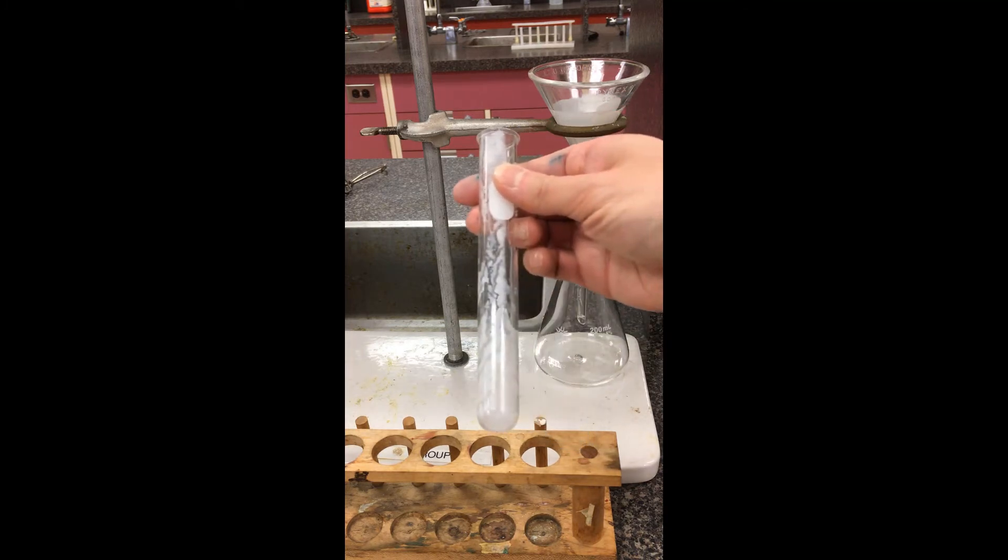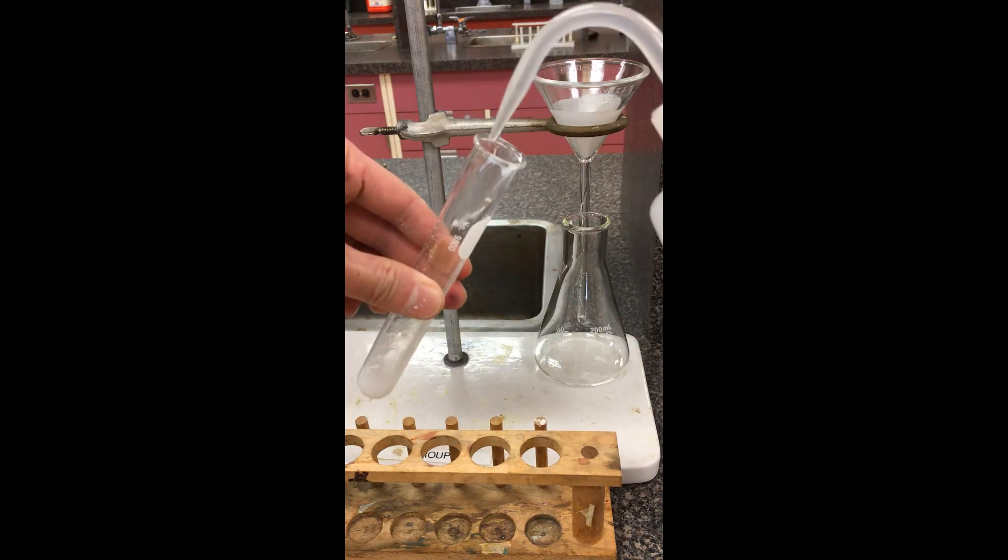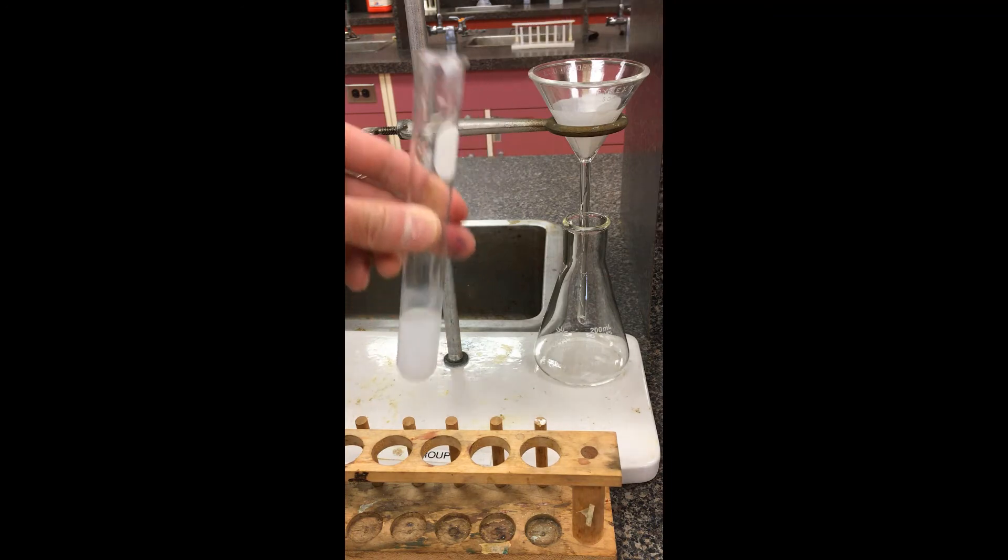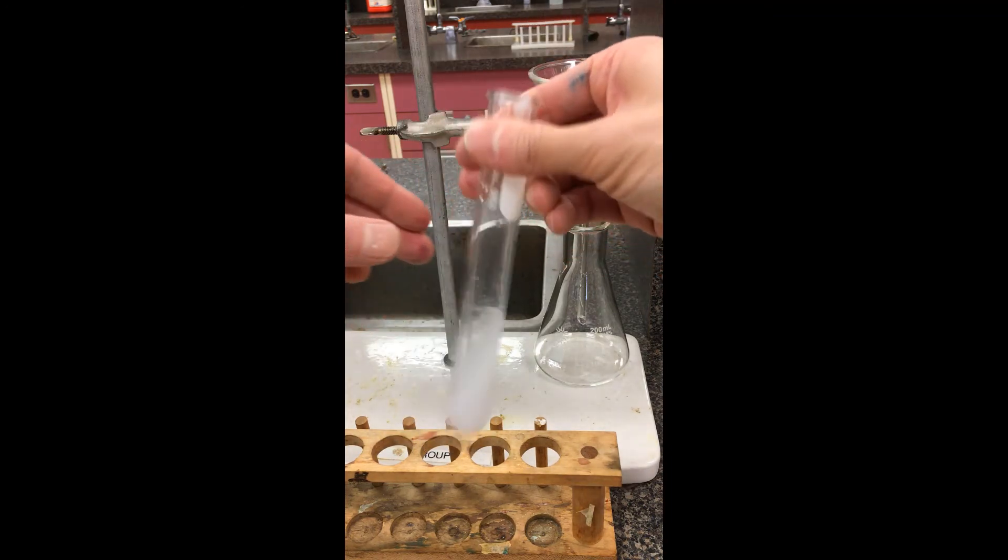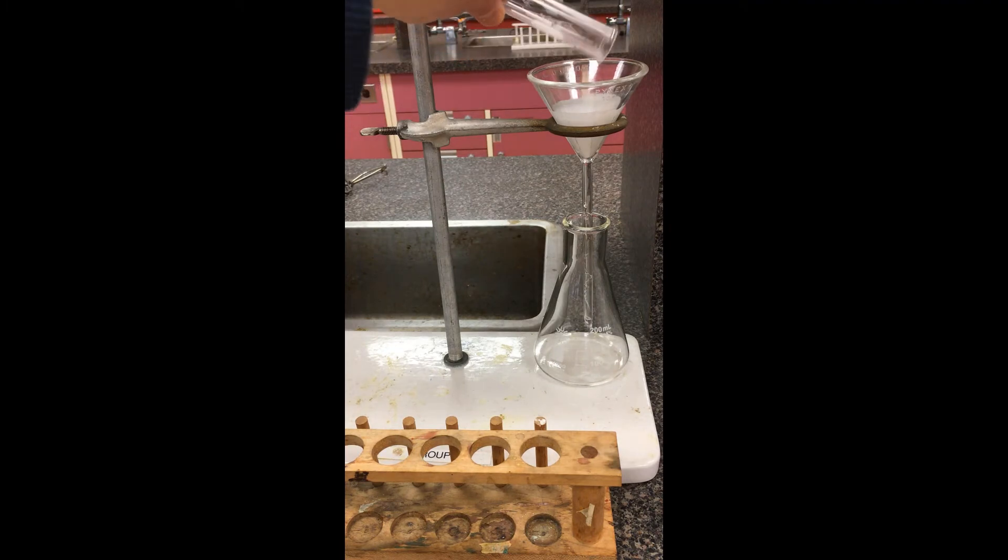You'll notice there's actually a lot of the residue left in my test tube here. You can actually wet this with just some extra water. Just roll it around a bit here. I want to make sure I collect up all the solid and have a good determination for the mass of the solid formed.